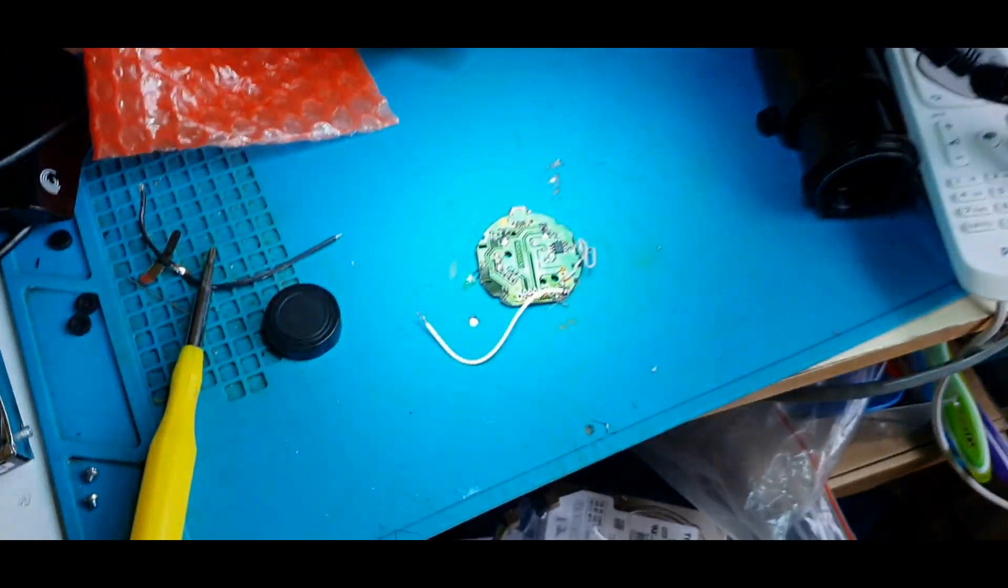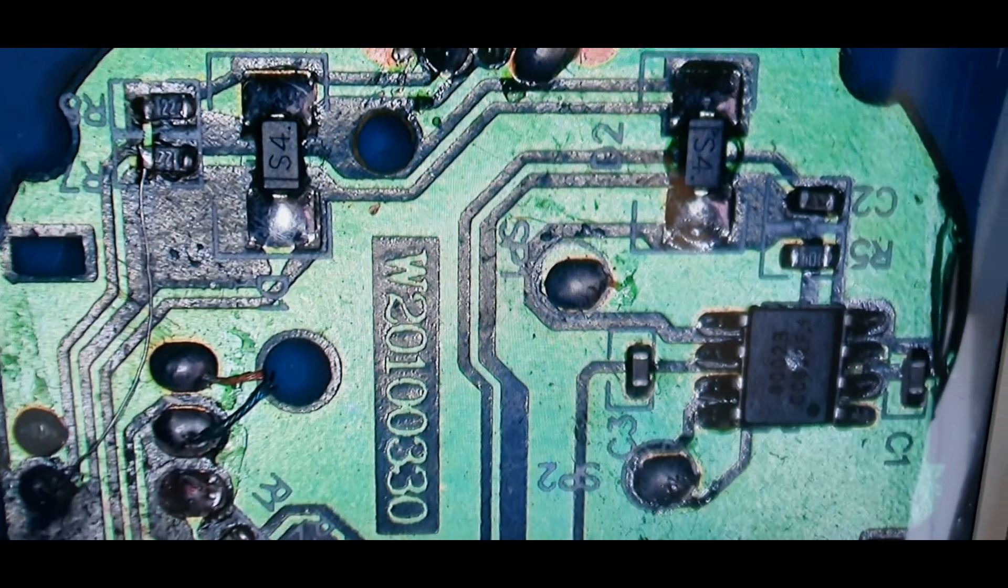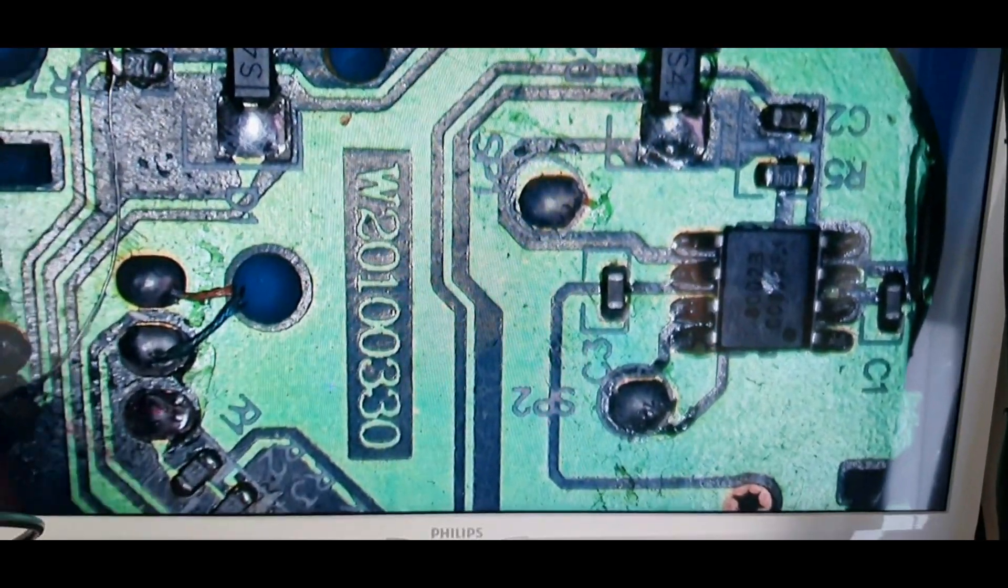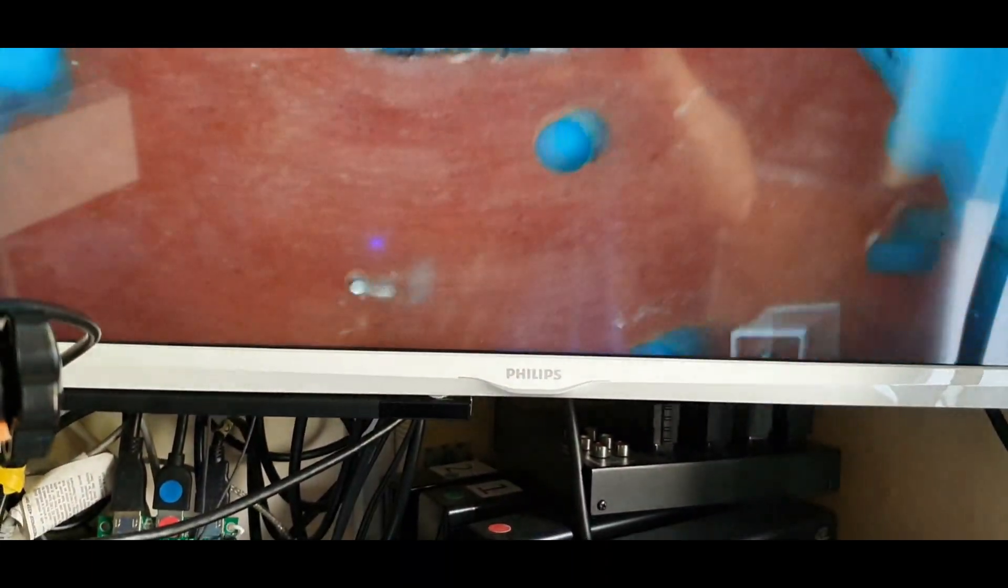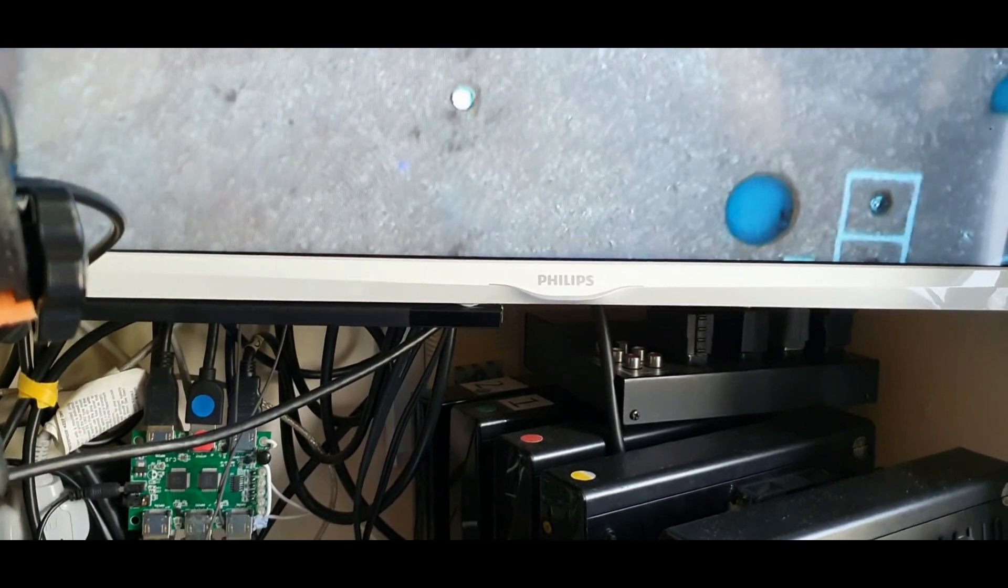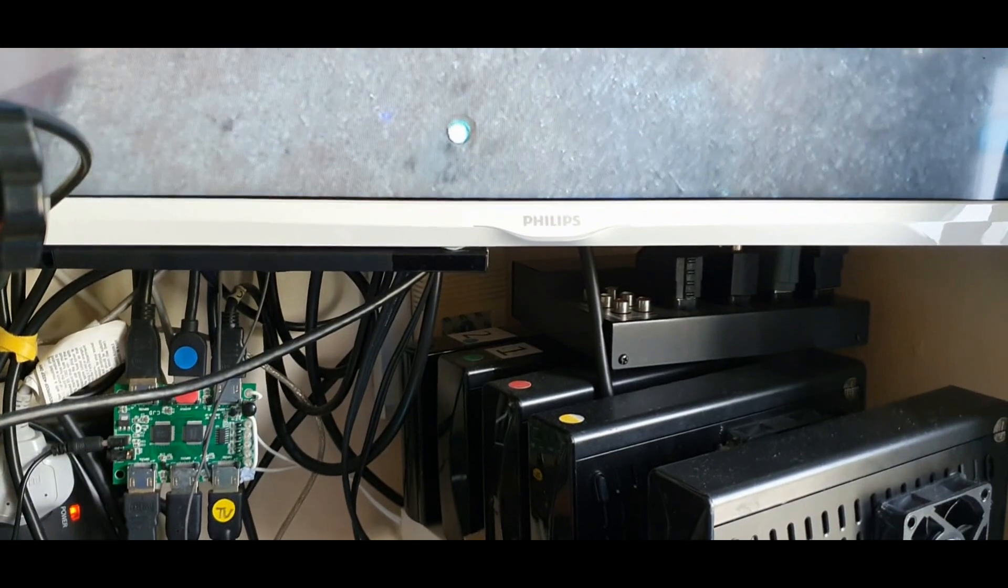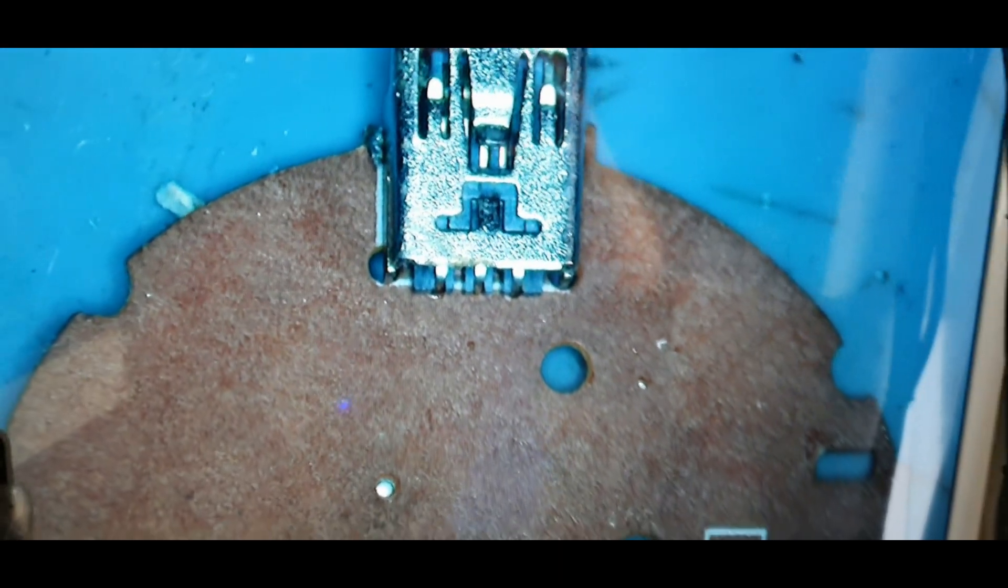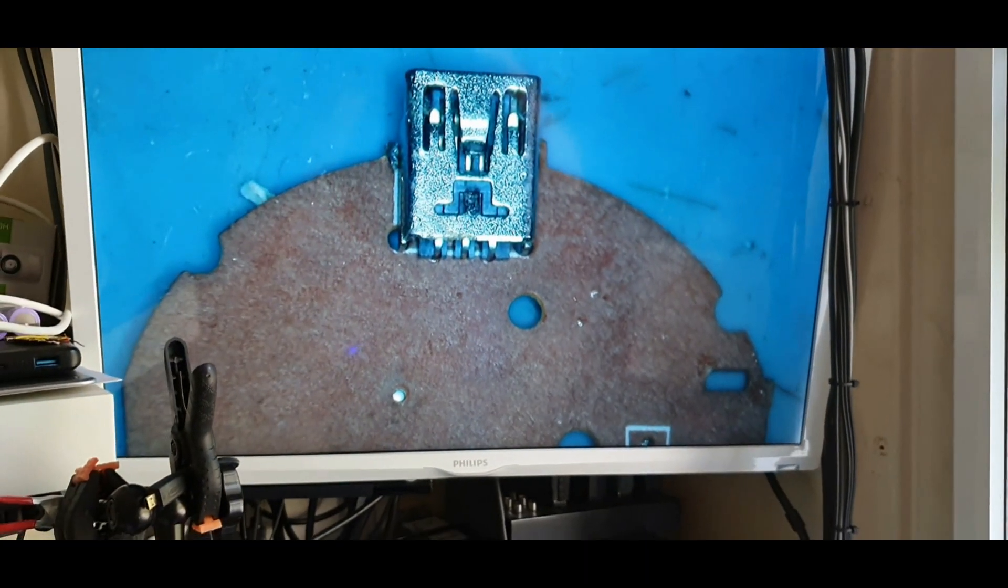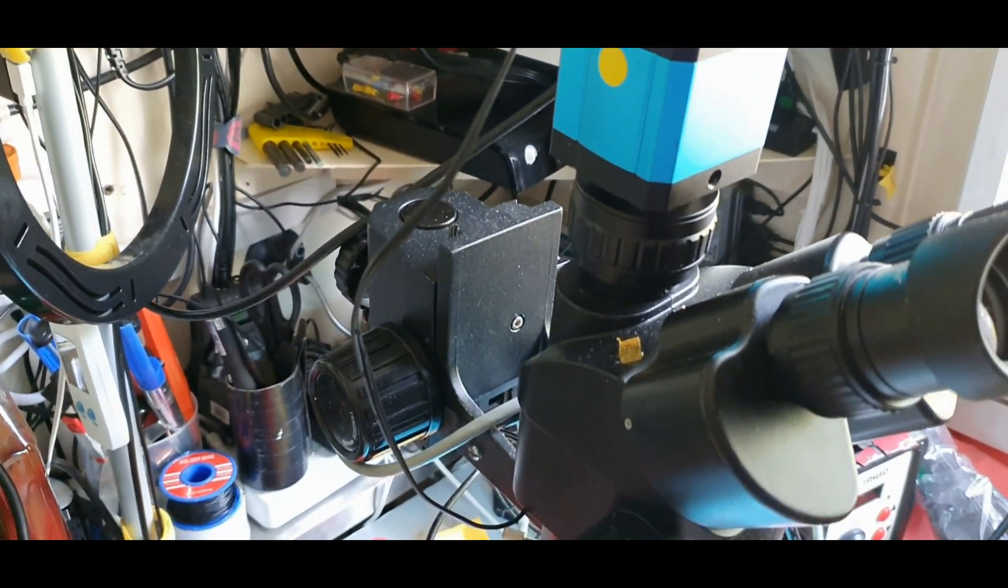You can see the two corners on it. Turn it around again. Yeah, there's a big difference. I can see both sides now. Works fine.